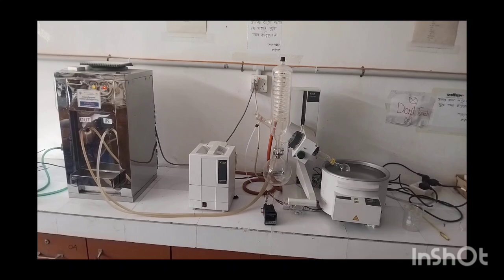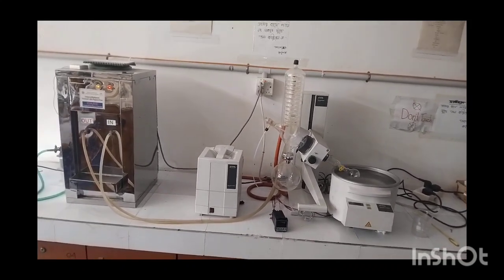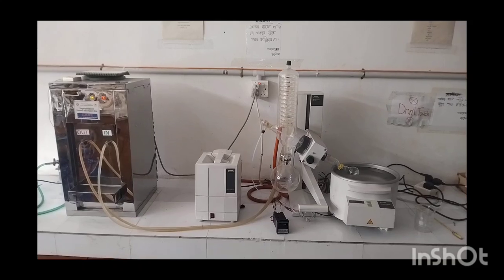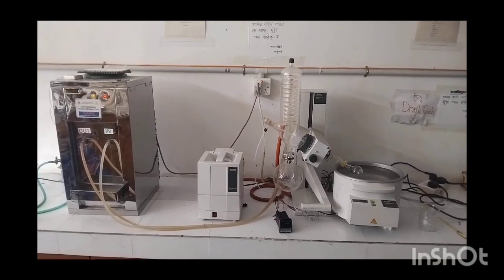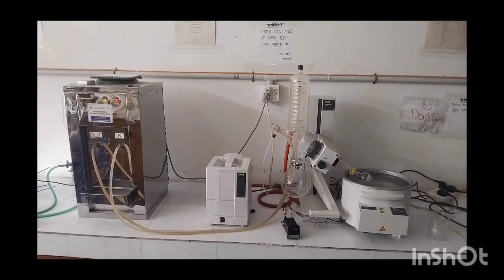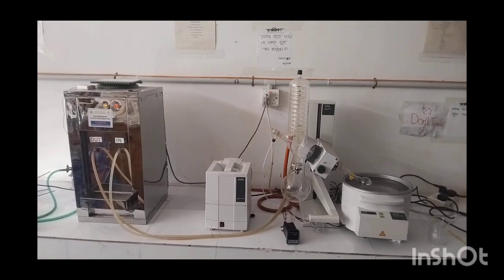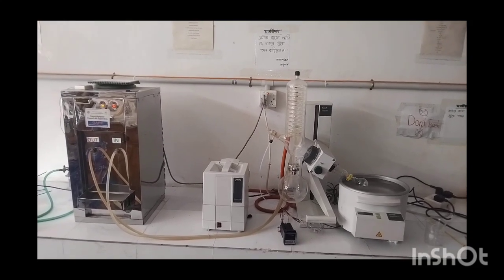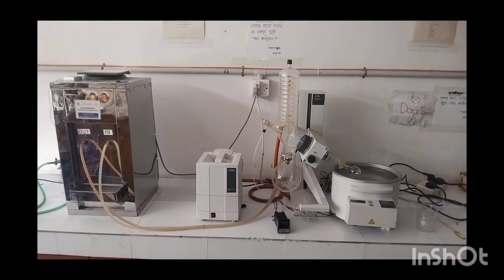Today I'd like to introduce a system that is called a Rotavapor. By using this specific system you will be able to dry a specific mixture. In the mixture you will be able to see the availability of products, along with the presence of different kinds of solvents.